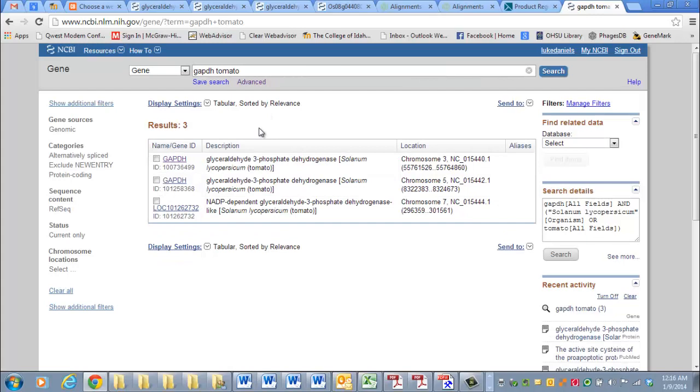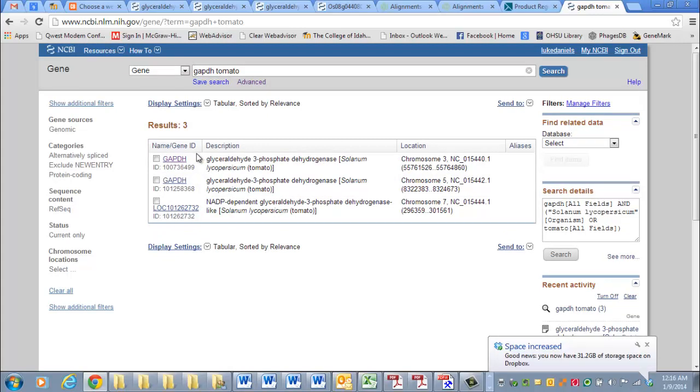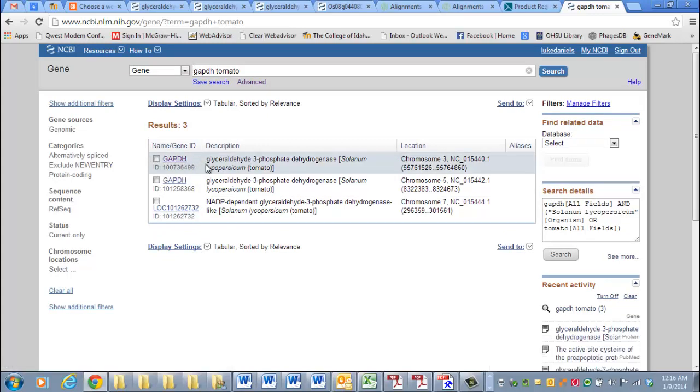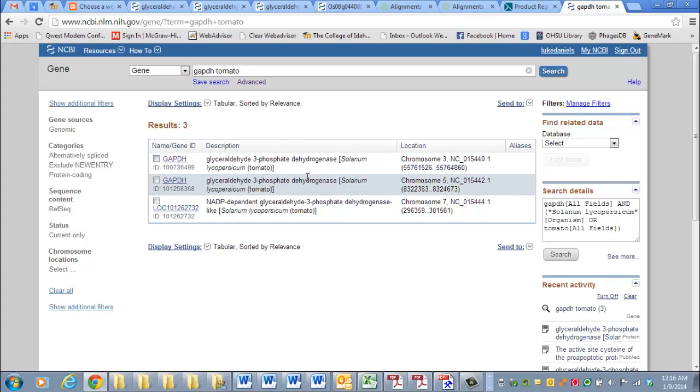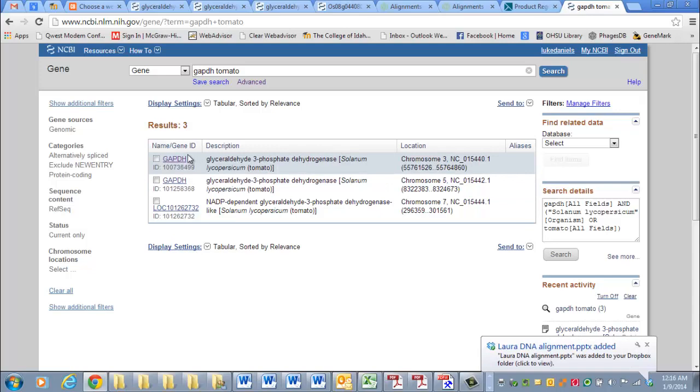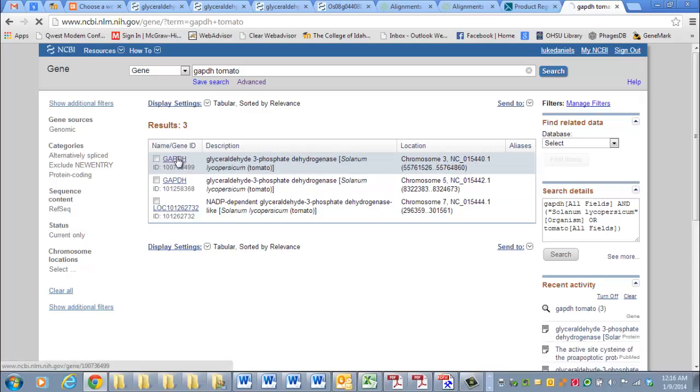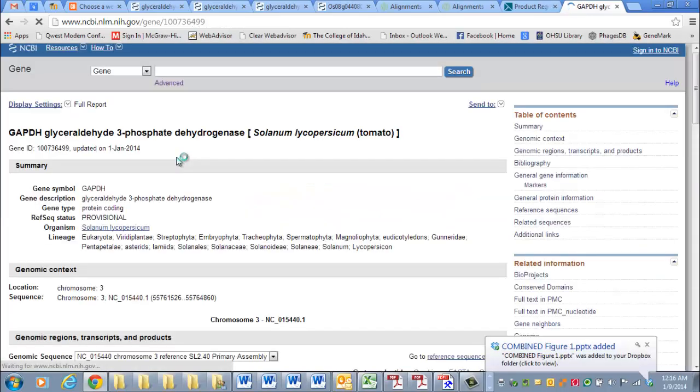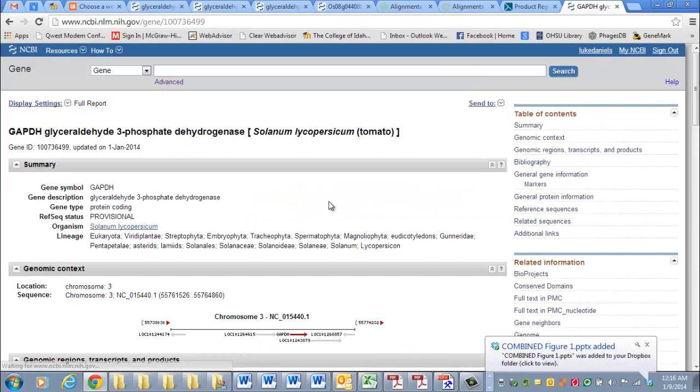And you've probably been here before, too. We'll select the GAPDH entry for Solanum lycopersicum, which is the Latin name for the tomato. And it brings this up.